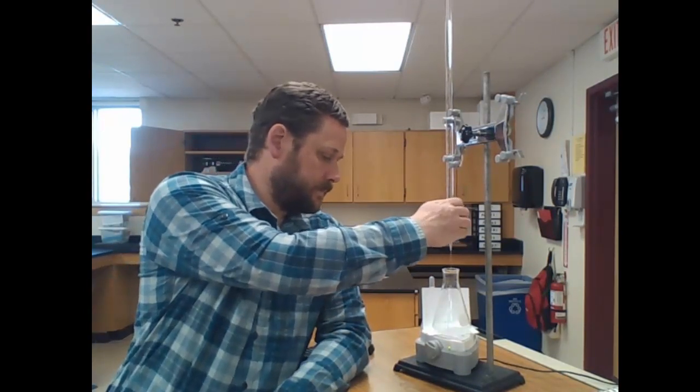What we're analyzing here is an aspirin tablet, which I've dissolved in water. Now I'm going to start adding base, the titrant, and I'll add just 1 milliliter at a time. Now you may see that a little bit of color appeared for just a moment as I added that 1 mil. That's because momentarily there's an excess of hydroxide ions that have yet to react with hydronium in the acid solution, but it doesn't take long.